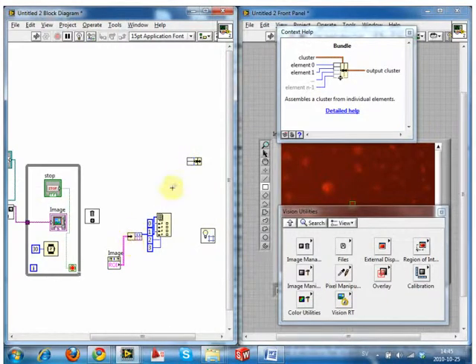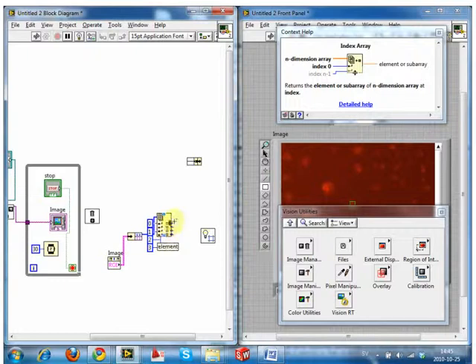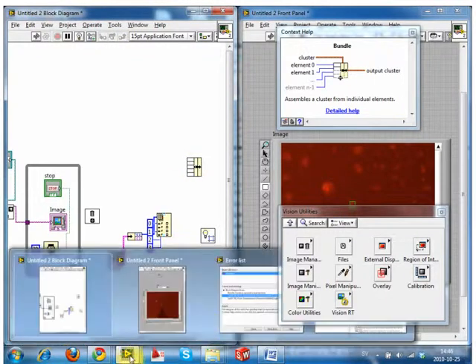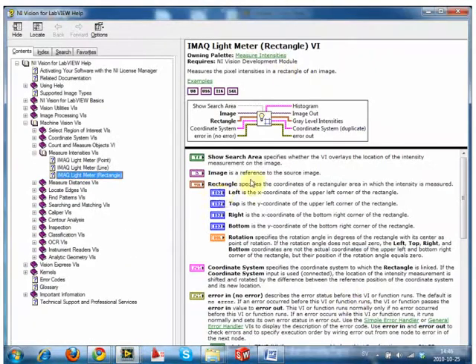And just like we did with the index, if you grab the little tab on the bottom, we can make it bigger so we can put more things in it. And it expects 5 things, just like the help file said. It's essentially 4 32-bit integers and then a double precision number. So we need to give it exactly that. If we don't, it'll say, look, there's a problem.